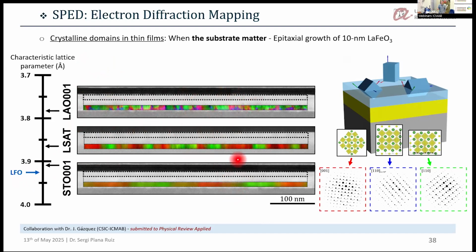So we can understand directly how these films grow on top of each other, the granularity, if you may, of these thin films. Also, once again, here we had 3 different configurations possible, and that's why we could make these 3-color maps out of it.